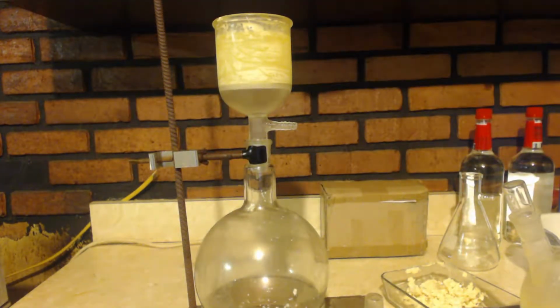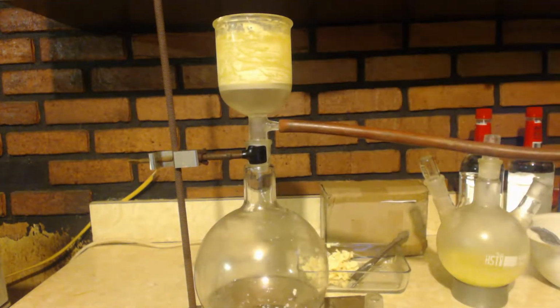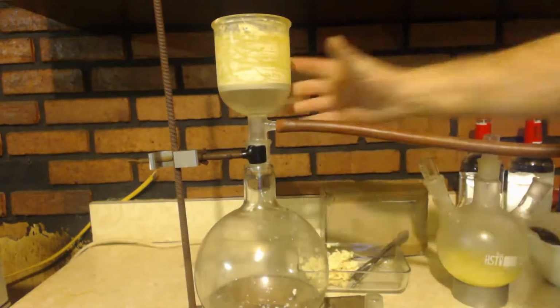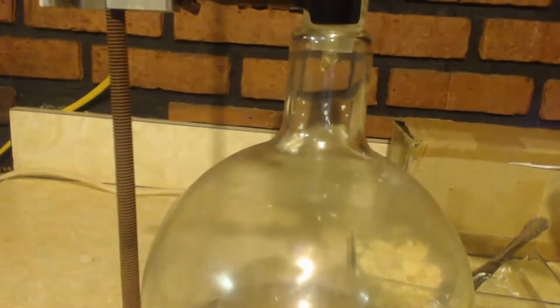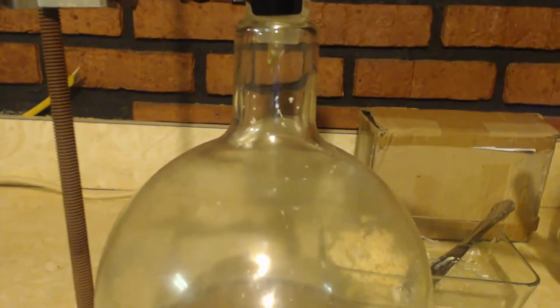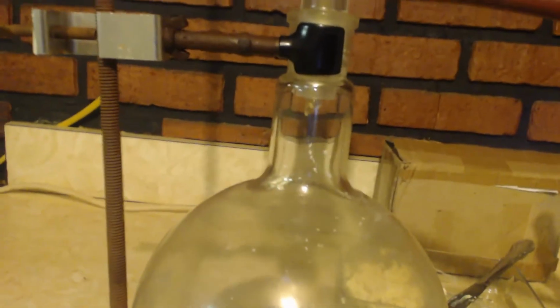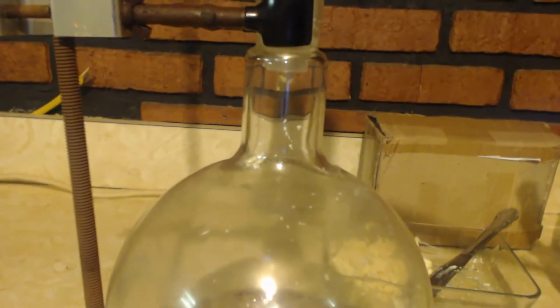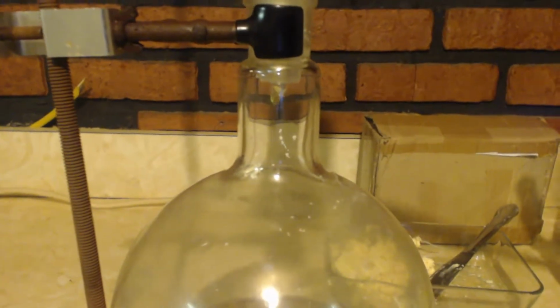Since this has got to be melted now a little bit, I might not film all this. Let's see if this helps. And you can see it dripping through there. This is going to take a while. But when it's done, I'm going to filter the nitric acid, the actual pot, everything that was in the pot. And then I'll show you what I got.